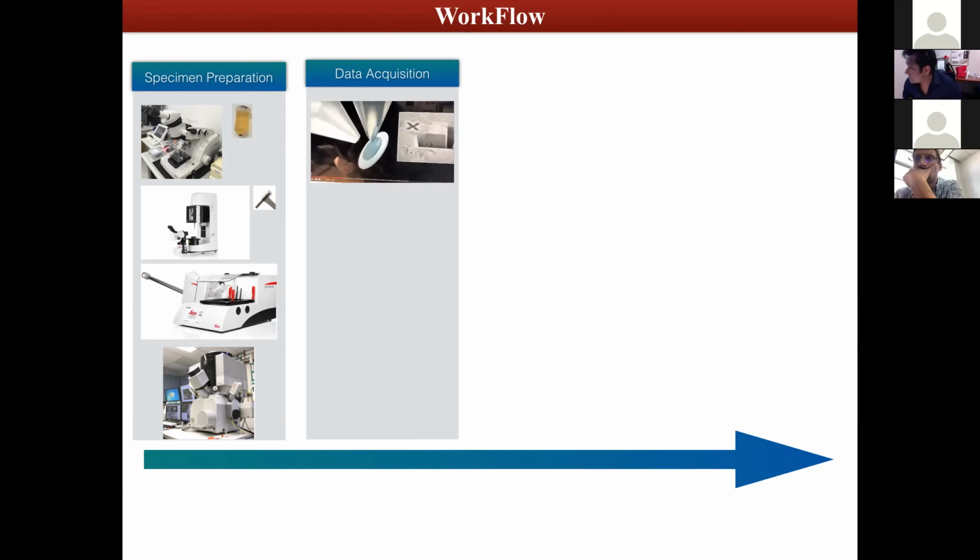You see this video that I have collected from YouTube. Now you see that this red beam is the etching layer, which is the FIB. It cleaves off the top surface, the SEM takes an image, and then the FIB beam comes in, again cleaves the top surface, and then the SEM takes an image. Now this goes into cycles.